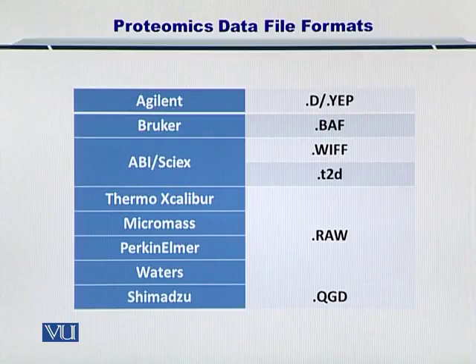file format. So all of these formats are binary formats. You cannot read them yourself by opening them in any text editor. So essentially, 2 points need to be taken from this table. One, that each manufacturer has its own data file format, and 2, that these data formats are actually binary. You cannot read them yourself, so you need to convert these raw data file formats into human legible forms.